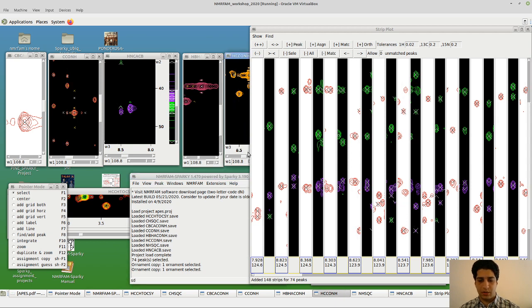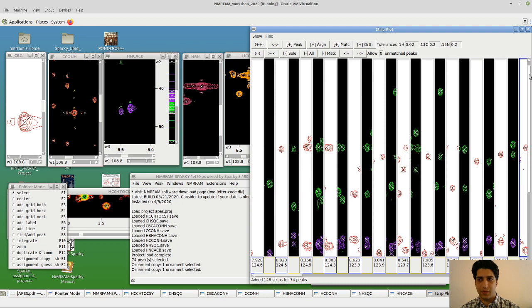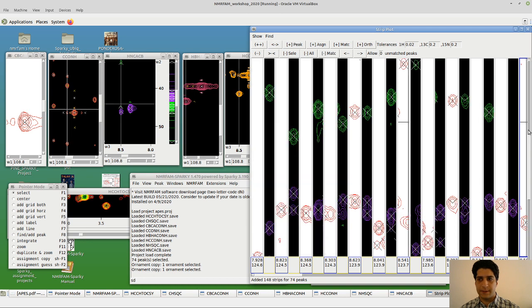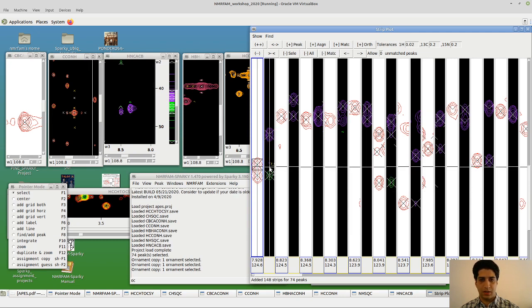And we get to this part. Let's see. So we have 2 here and we have 3 here. So it's the same situation, yeah? So let's see. These two are matching. This one is not here. We can just select OC, copy, going here, OP, paste.